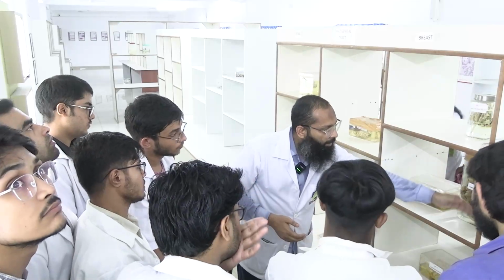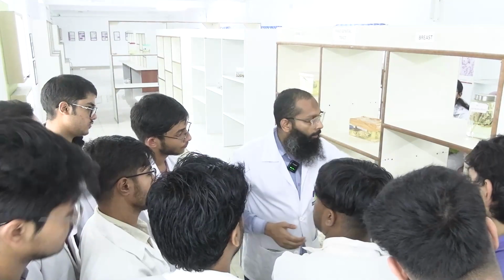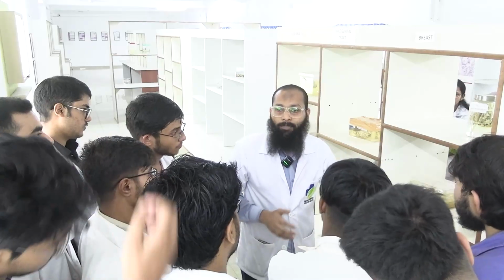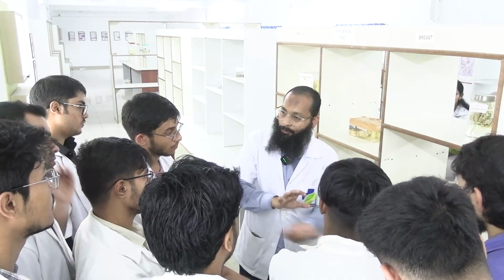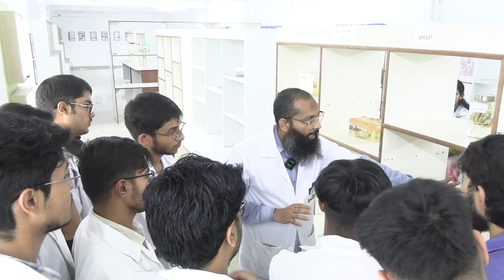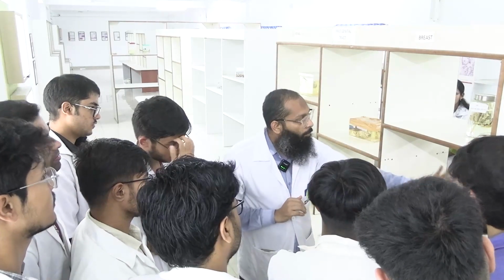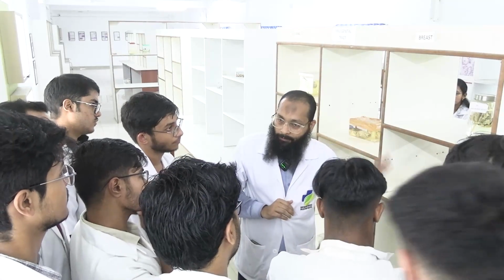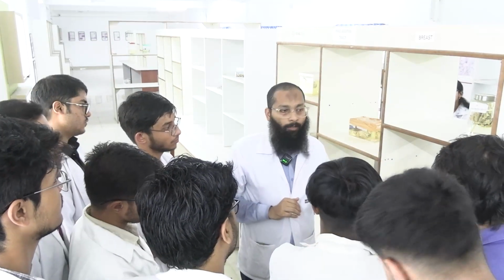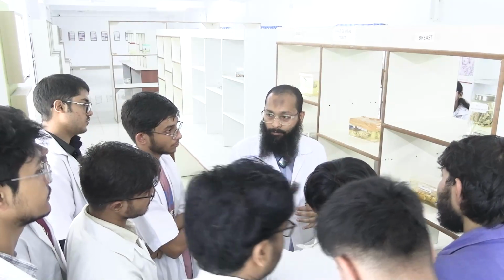Now suppose this specimen has been taken out. Is the blood supply still there, or has it been cut out? The surgeon has taken out this specimen, the blood supply is cut off. So if it is not inserted in any fixative solution, then the specimen will start autolyzing.